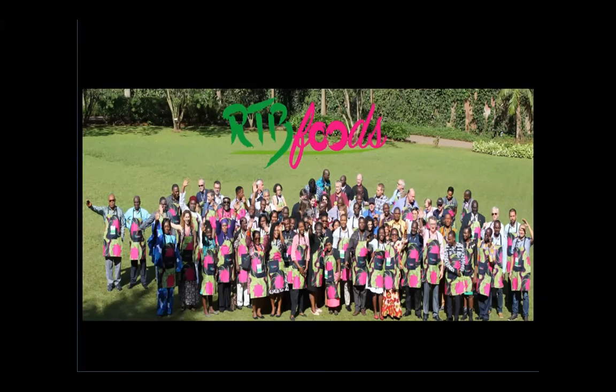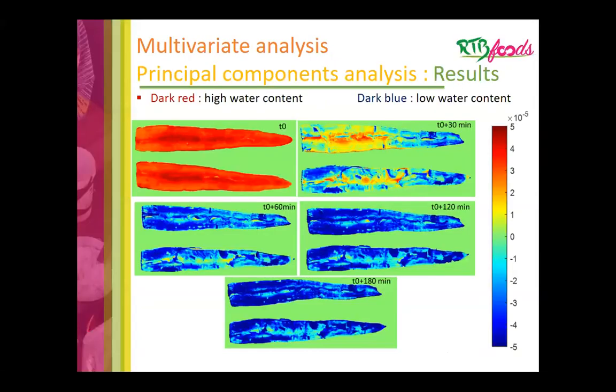The question might be not only how long does it take to take an image, but how long does it take to process the data to produce the useful image? Yes, the data acquisition is easy. It's very easy, but the processing of data is difficult. So it takes more time than acquisition of images. So how much time?